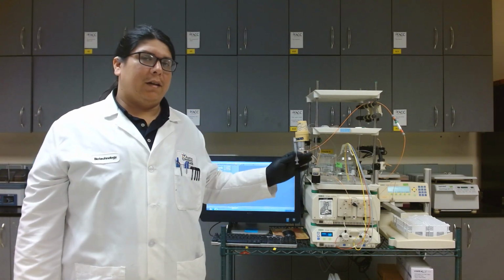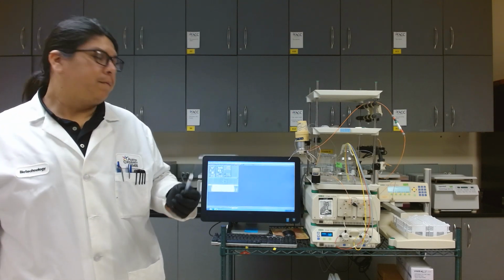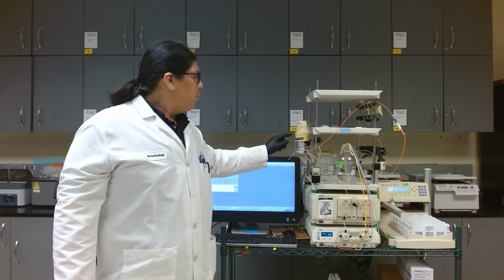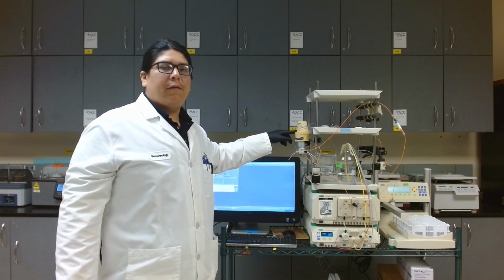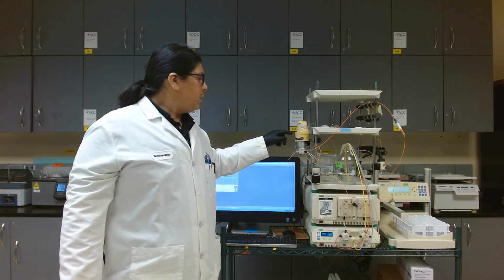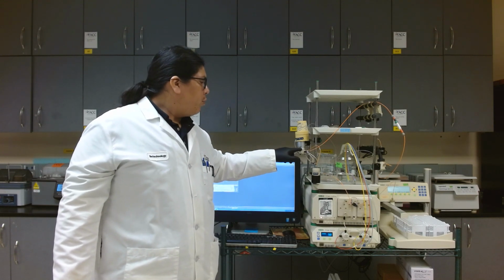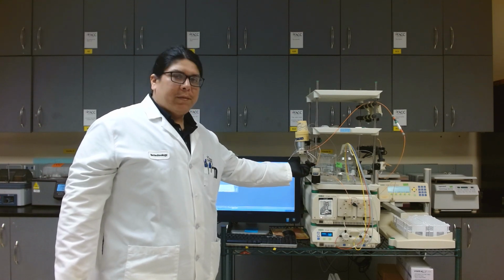What we're going to do is load the sample loop with our protein sample. Our sample port is located here on the inject valve. We want to make sure that the inject valve is in the load position. If you reference your diagrams for the inject valve, you'll see the load position. If we take a look at port 2, which is where our sample enters, it's going to enter port 2 and exit port 3, which is where our sample loop is connected.